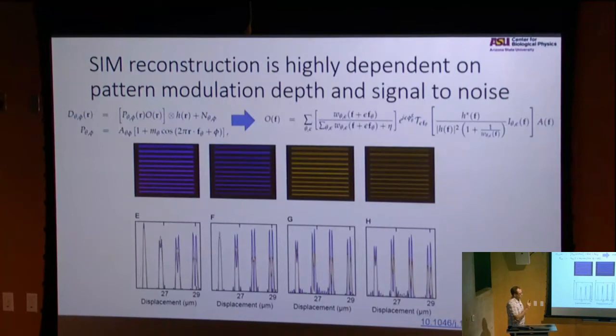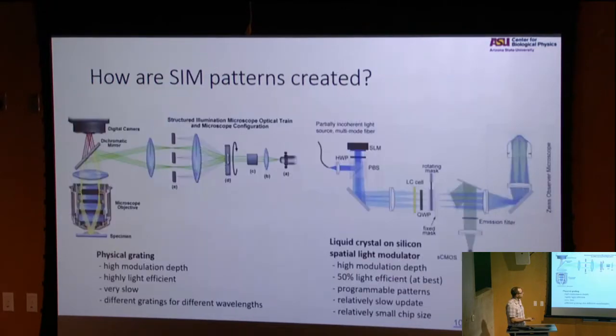Yes, correct. And that is a very strong assumption that we think gets violated quite often, and I don't have a great answer on how to fix that at the moment. Was there another question? I was just going to ask what kind of noise it is. Yeah, it's flat, so it's white noise. There are some questions about whether it's actually flat or not, and this is a whole problem that people are dealing with.